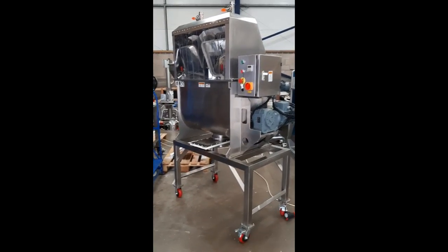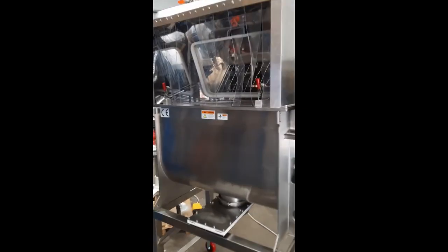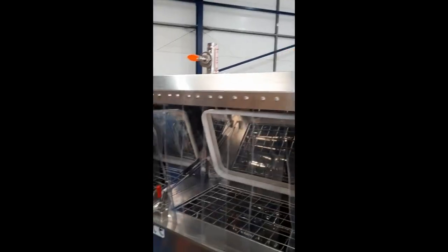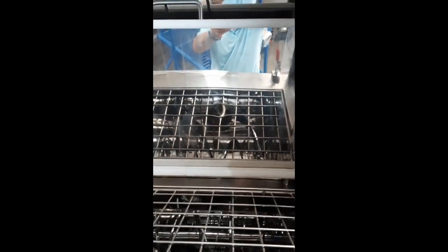200-litre stainless steel ribbon blender with dust hood and curtains for dust containment. It also has two dust extraction outlets if you want to hook up an extractor unit. The lid opens up inside the dust hood and closes within the dust hood.